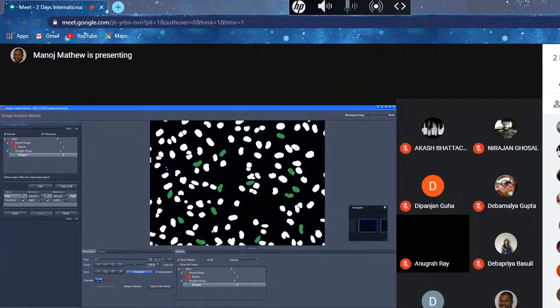Yeah. So I've selected objects that I thought are elongated enough. Of course, if you have not selected the criteria very carefully, you might see some overlap between the two groups. But you see, these two groups are rather well separated out based on the criteria I specified.